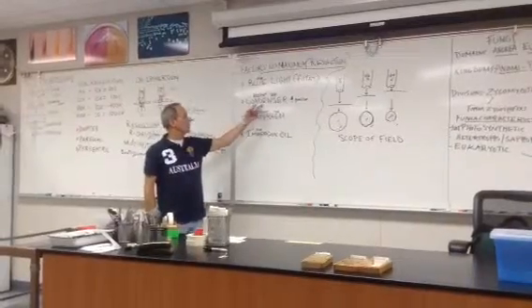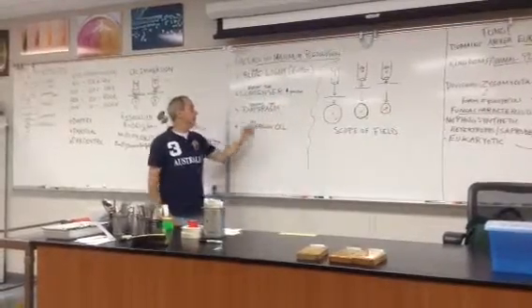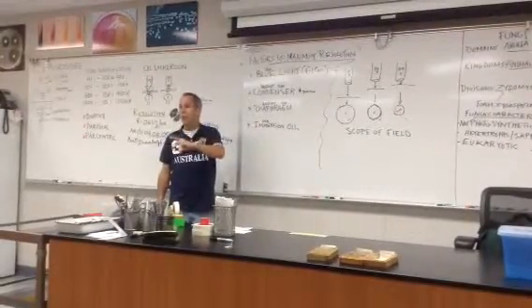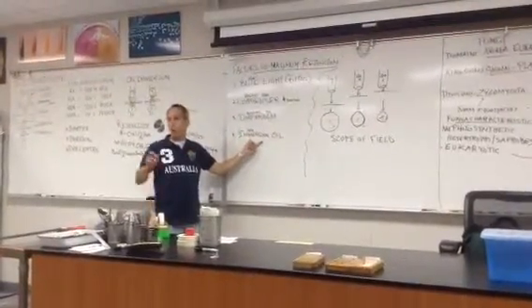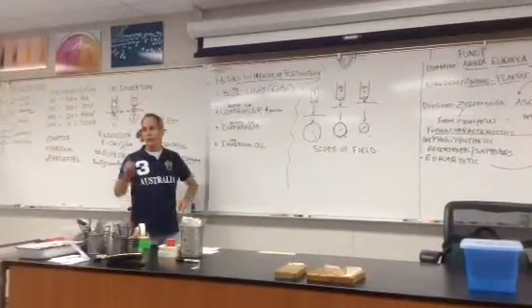We have to adjust the condenser so that it's all the way in the up position. I'll show you that when you all get your microscopes. You have to adjust the diaphragm. What I'm referring to is the fact that it has a setting, 4, 10, 40, and 100. That's what I mean by that. And then you have to use immersion oil on the 100 objective. These are the 4 things that you can do to get the best resolution out of this microscope.